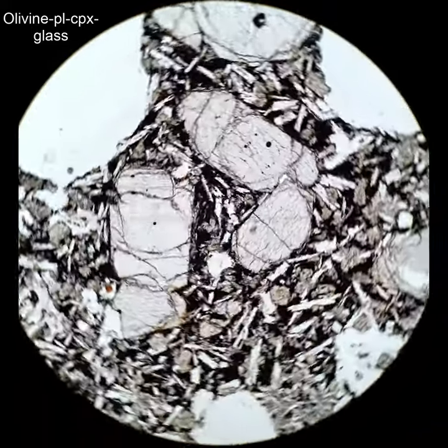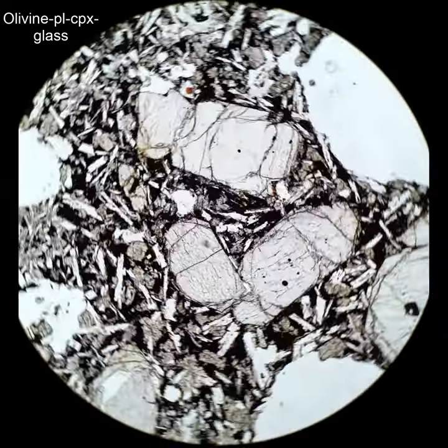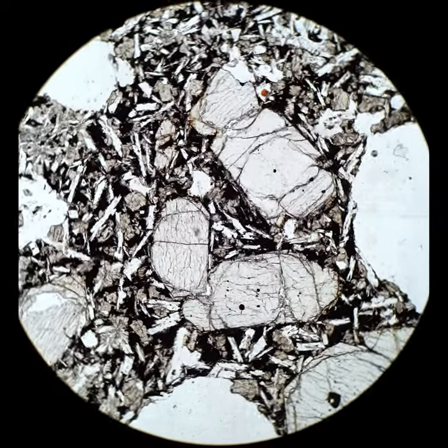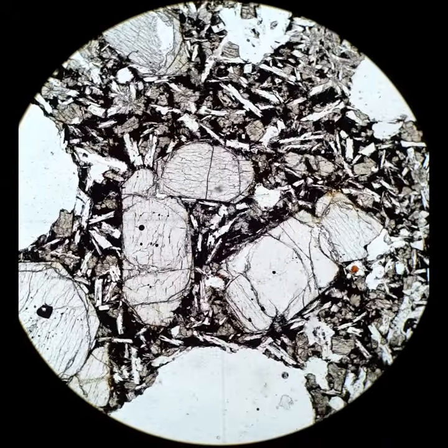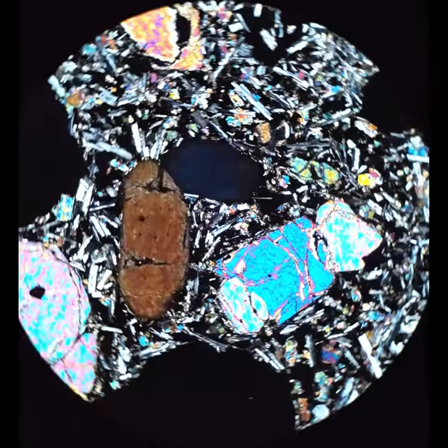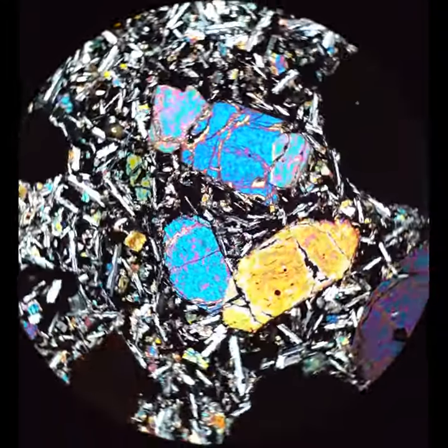All the big crystals in here are olivine, at least I think they are. They're like three and a half crystals in the central region. They are all at different orientations, but what you'll see is they have parallel extinction and a range of interference colors from fairly low to some pretty high ones.